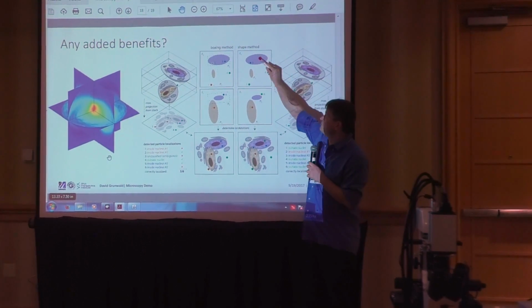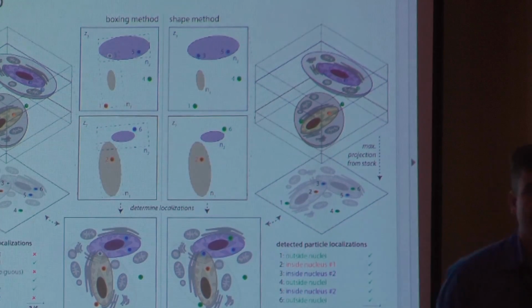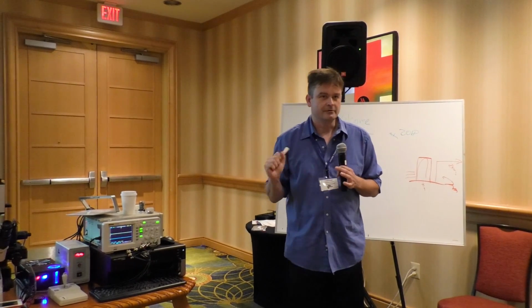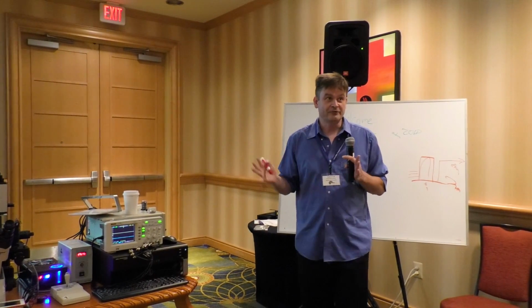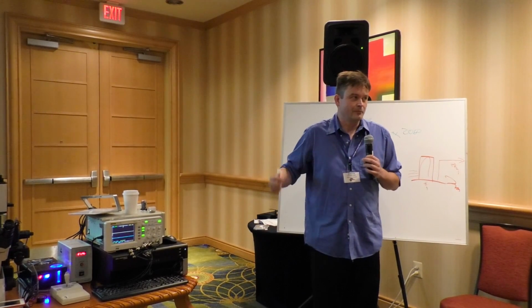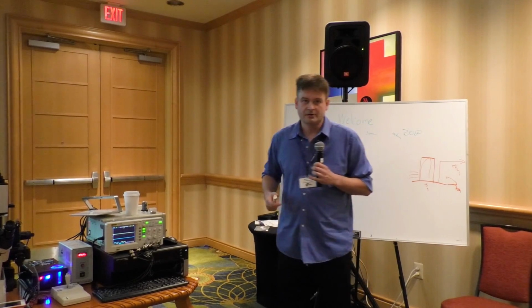And then you also can deal with your compartments, right? Because your nucleus, unfortunately, in one plane can look much smaller at the top than it looks in the center plane. Yeah. So once you start dealing with questions of how do I wrap a surface around a compartment that may be not even labeled completely, these data become very, very handy to you. Yeah. And now here's my take on it: joint analysis will eventually have to come up with joint data processing SOPs. And we're just providing one piece towards the goal by saying, look, we know what you can know about a microscope. Why don't we record it? It's not that hard.